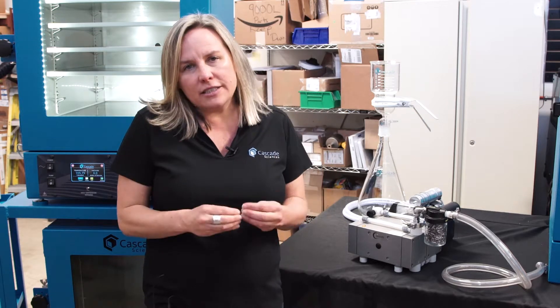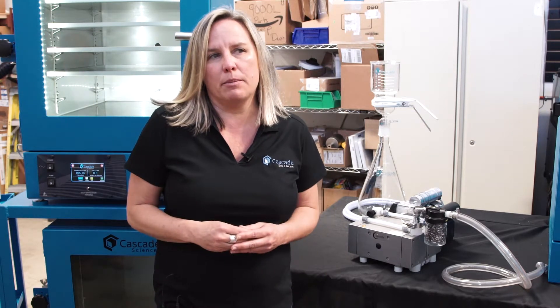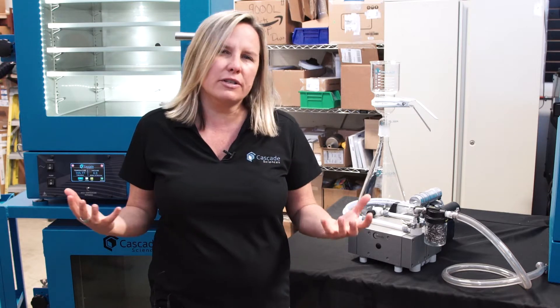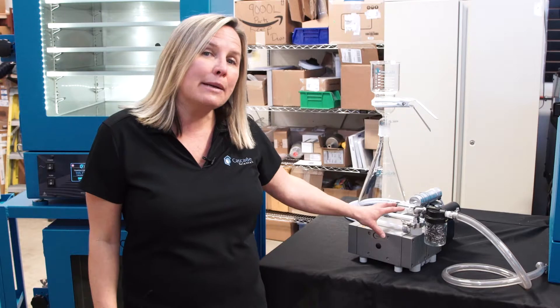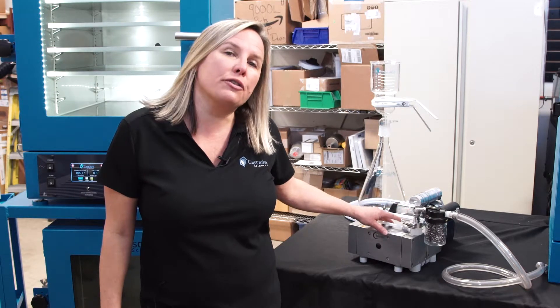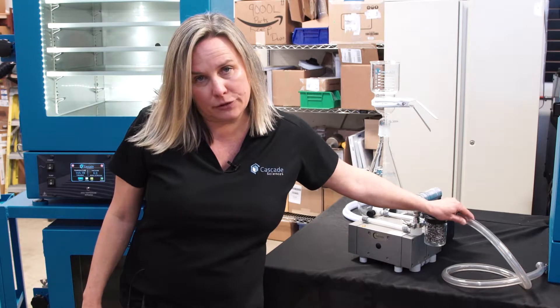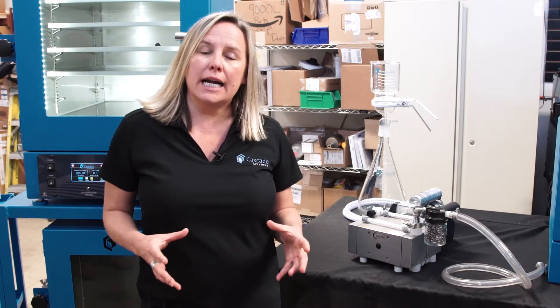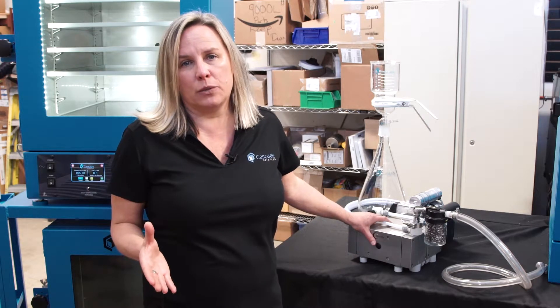The cost savings are why I want you to know about this pump. Welsh will sell this pump for somewhere between $3,600 and $3,800, but the Cascade private label version sells for under $3,000 with the filter and the connective tubing. When you order online at CascadeSciences.com, the CB2052 comes with free shipping as well.